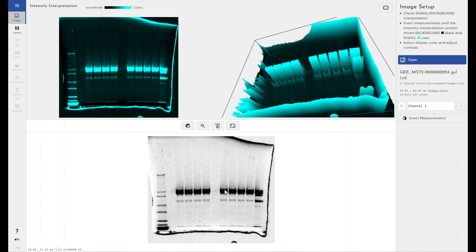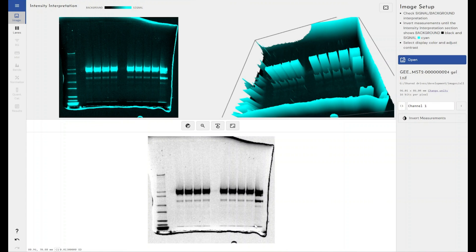So to do this we calibrate it to the relative front, which is not hugely visible in this image, but it is the dye front of whatever dye you've included as part of your experiment when you've run your sample on your gel.